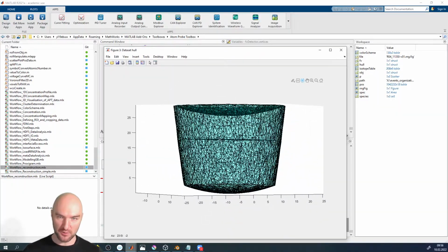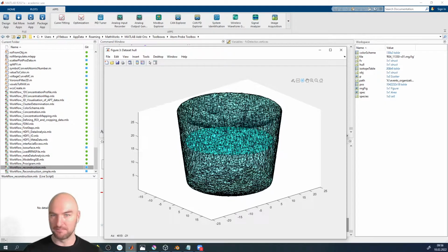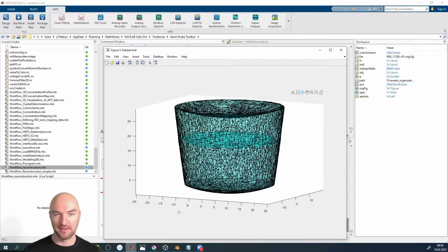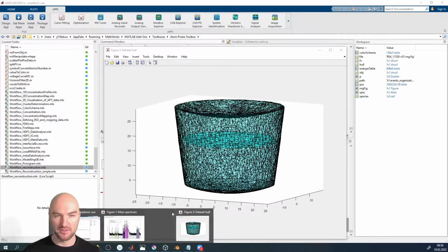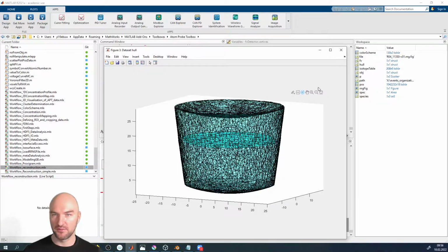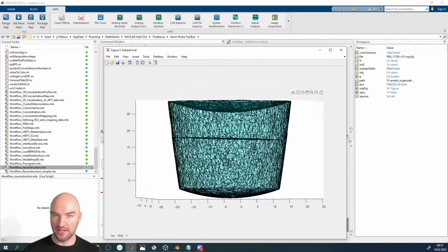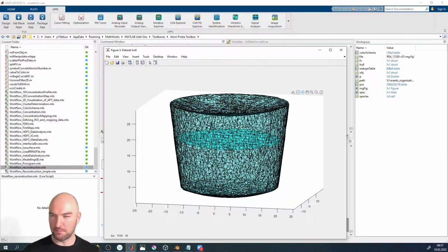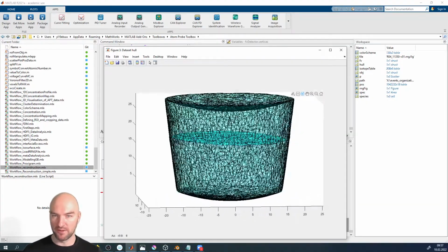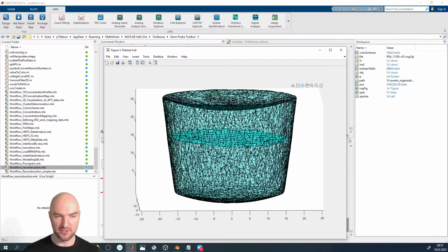So the first question is now then, well, let me just close that up so that we only have the remaining few figures remaining. How do I get the grain boundary to sit perfectly on our atomic positions?